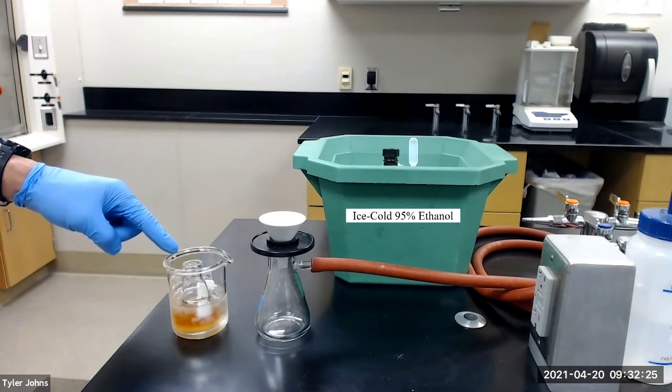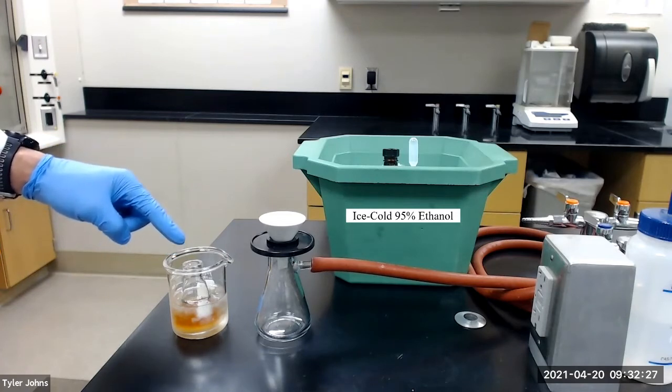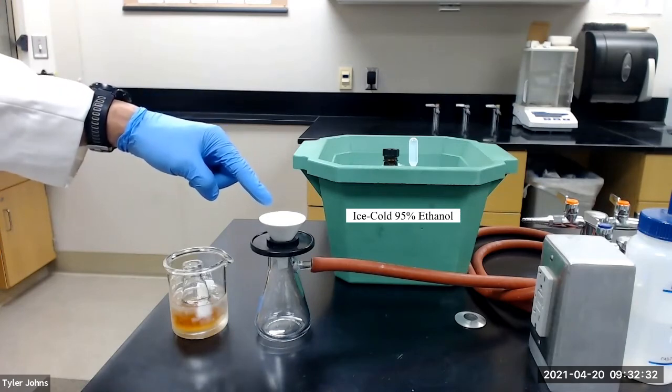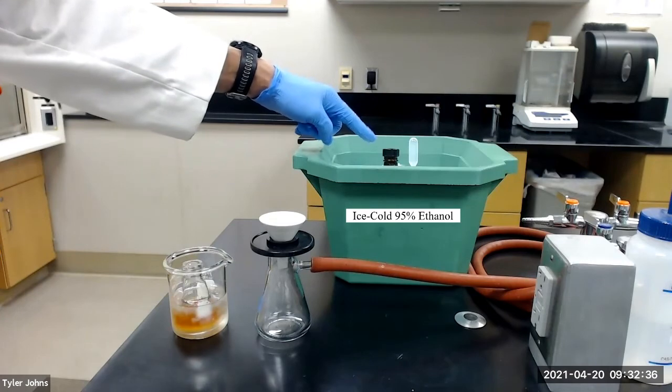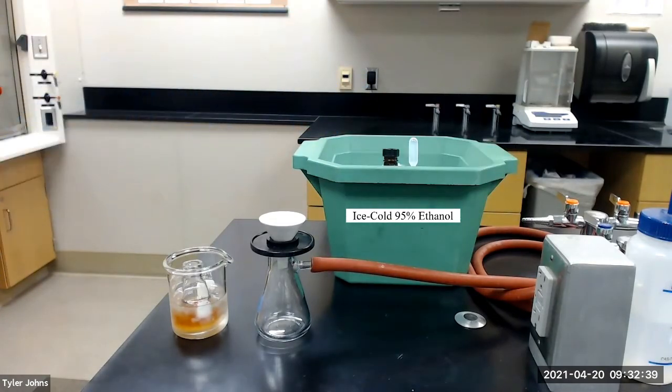After crystallization is complete, we will collect the recrystallized substituted chalcone crystals by vacuum filtration with a Hirsch funnel, and we will use ice cold 95% ethanol to aid in the transfer and the washing of our crystals.